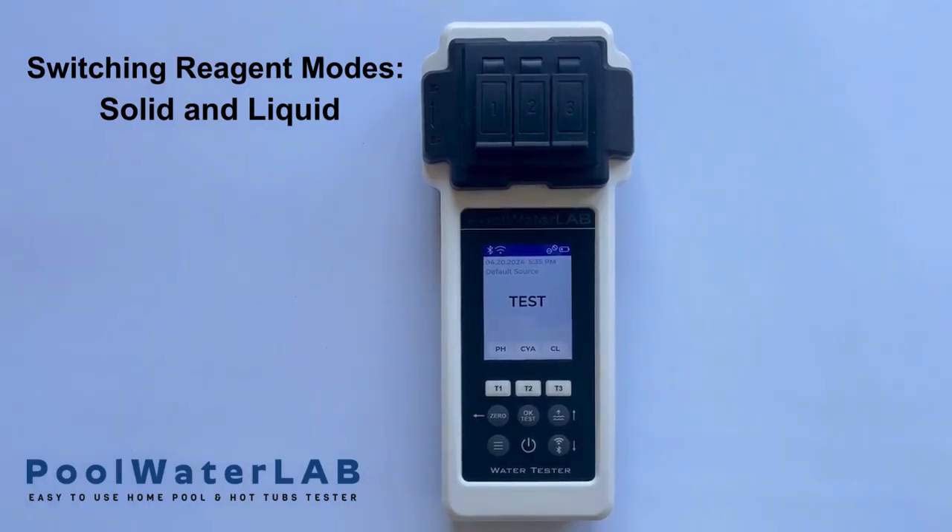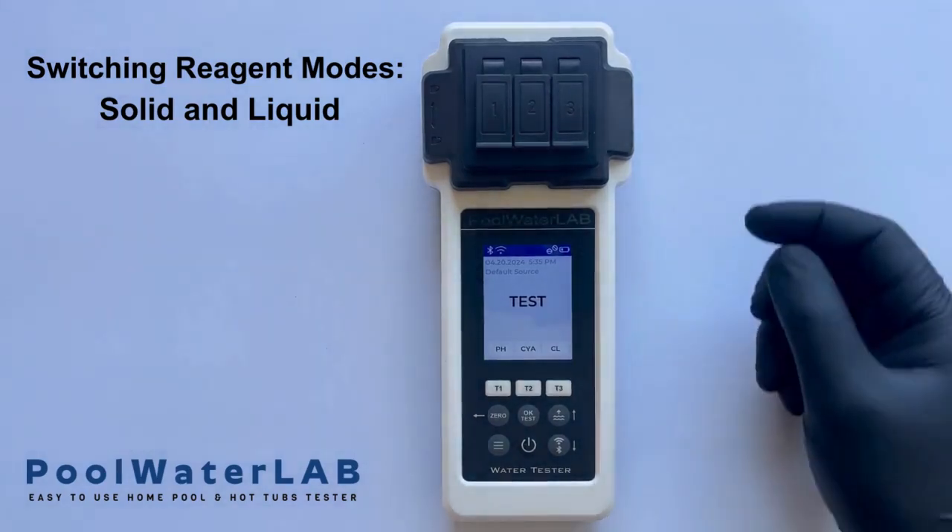The PULL Water Lab tester operates using two types of reagents: solid and liquid, specifically tablets and liquid solutions. This flexibility supports varied testing needs, allowing accurate assessments across different water quality parameters.